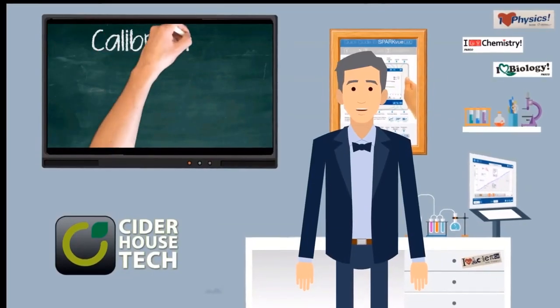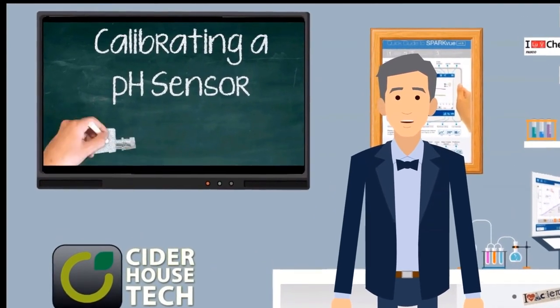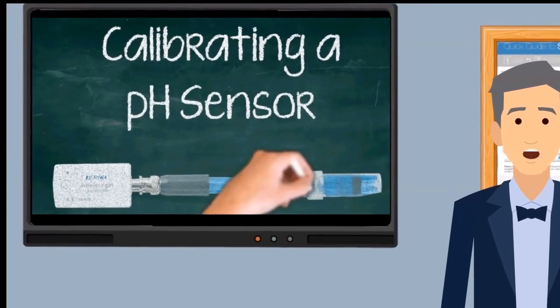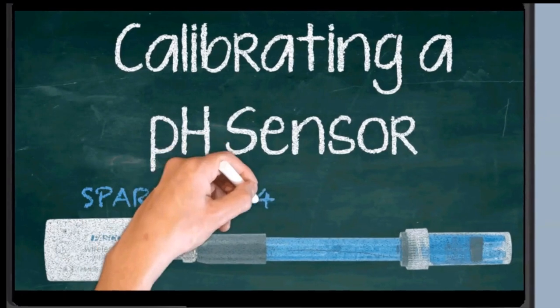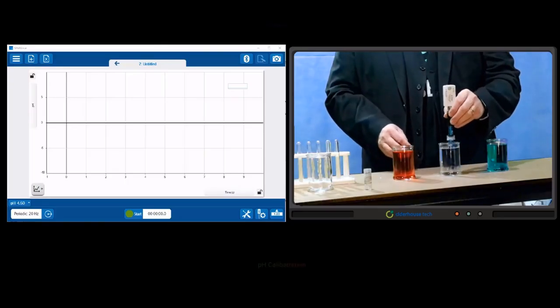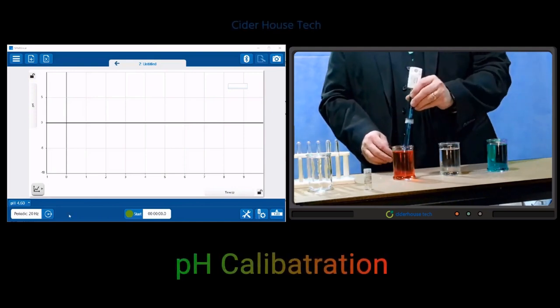This video from Pasco explains how to calibrate your pH sensors using SparkVue version 4.4 onwards. If you have wireless pH sensors, you should not have to perform this calibration very often, as the sensor saves the calibration to its inbuilt memory. This is a video showing how to calibrate a pH sensor within SparkVue 4.0 and beyond.